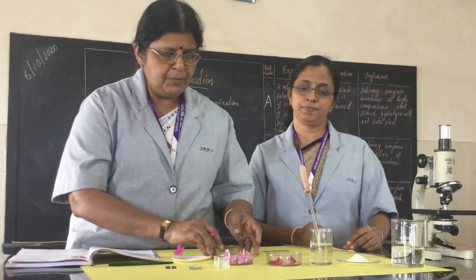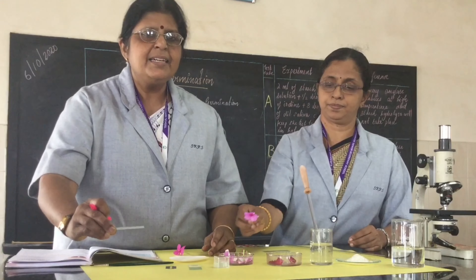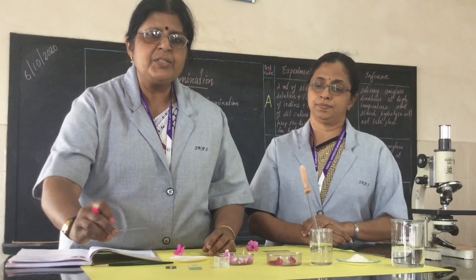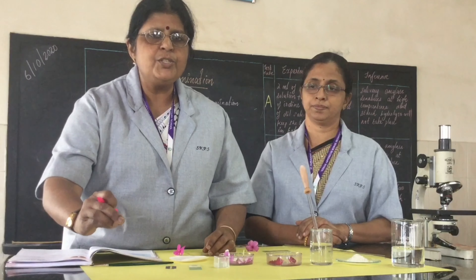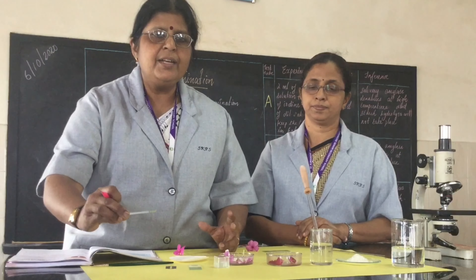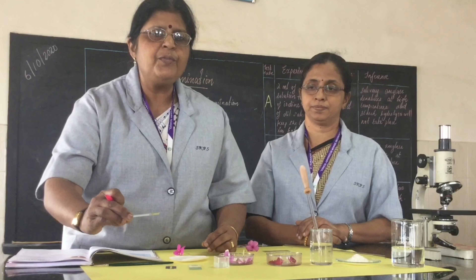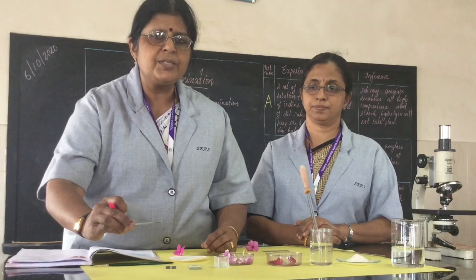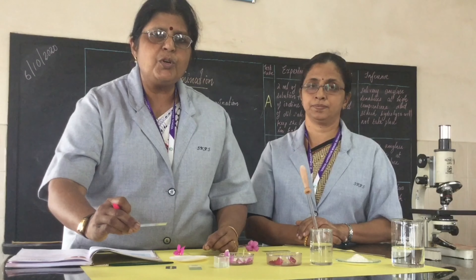Now, how to take the pollen grains. First, take the cavity slide and put one drop of nutrient solution into both the cavities. The cavity slide has an advantage — your pollen grains will not move out of position, whereas on an ordinary slide they will flow around. We have put a drop of nutrient medium in the two depressions seen on the slide.